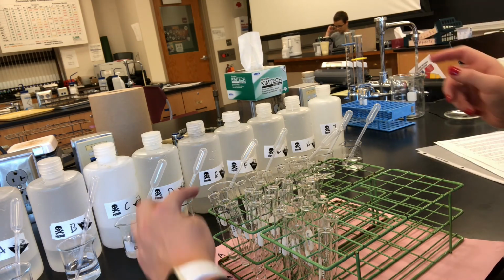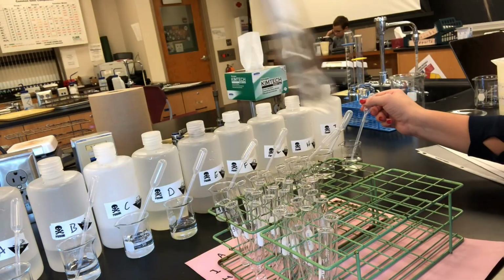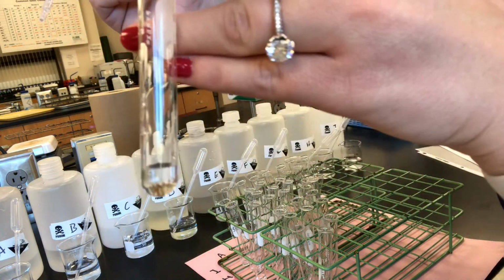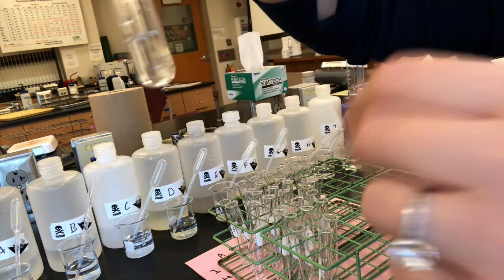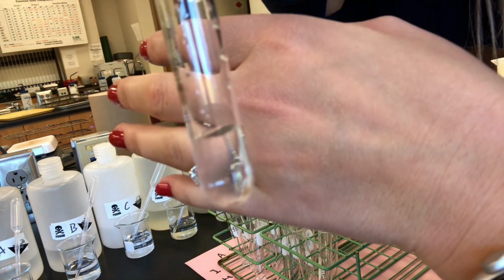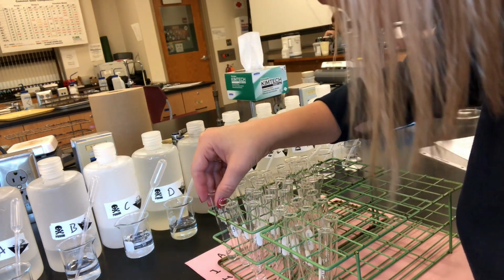The first one here is unknown A and half a milliliter of unknown I. So this is A and I being added to it. Let's see if I can get this so you can see it well. All right, here we go. A and I. I don't see a whole lot happening. Still clear and colorless. No heat. No nothing. We'll come back and check them all at the end though. So that was A and I.